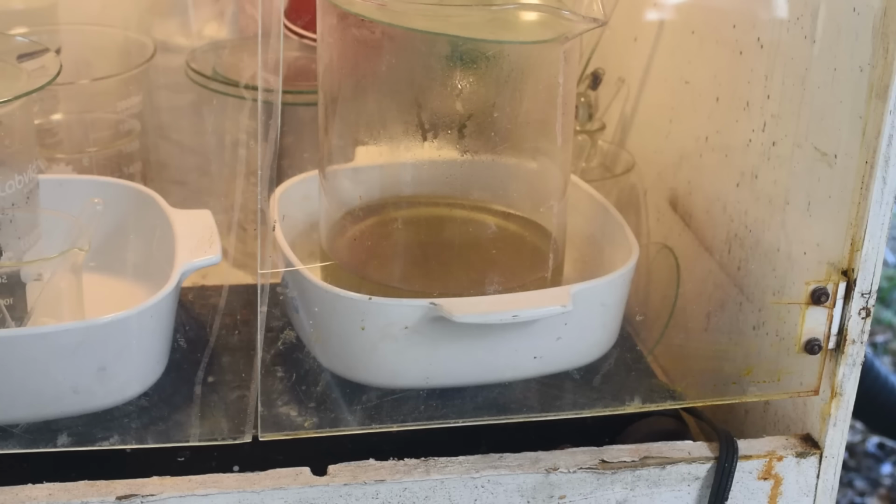So I would say we've got some kind of metal going into solution in there in the aqua regia we made. Hopefully gold. That would be nice. So we shall see. I'm just going to let it cook until I don't see any more activity. Then I'll probably put in a little more nitric acid just to make sure that we got everything into solution. So for now, I'm just going to let it cook.